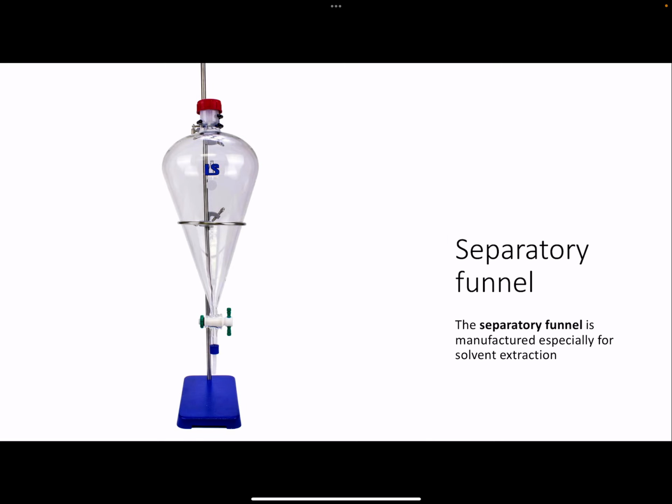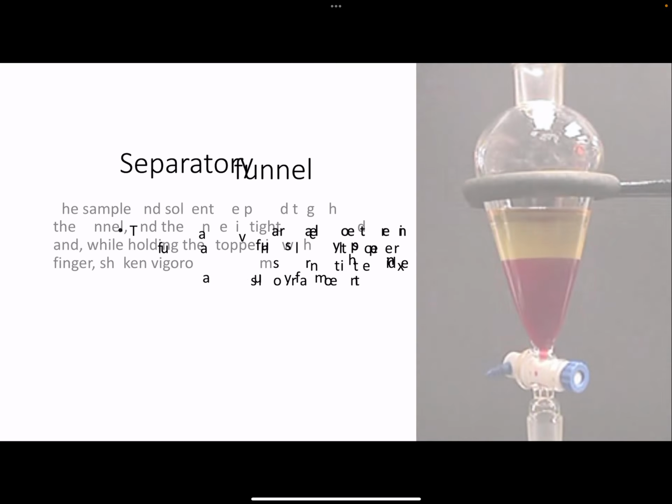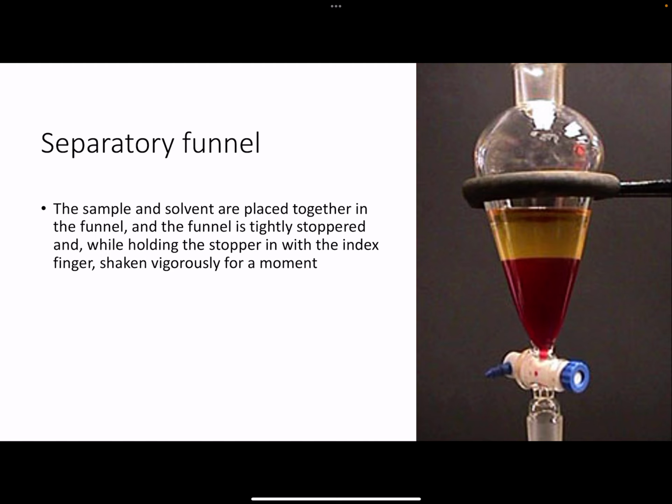Okay? And this is a specialized glassware called a separatory funnel specifically for liquid-liquid extraction. So, makikita natin, this is what I was illustrating earlier. This could be your extraction solvent, and this one could be your original solvent. It depends, kung ano yung mas dense sa kanilang dalawa. Okay? Again, sabi dito, they are placed together. So, pinagsasama na sila agad with stoppers sa taas and a stopcock sa baba.